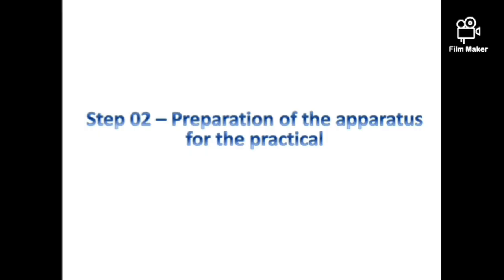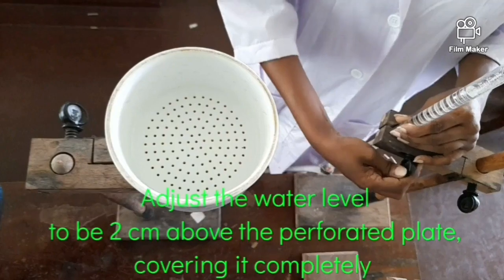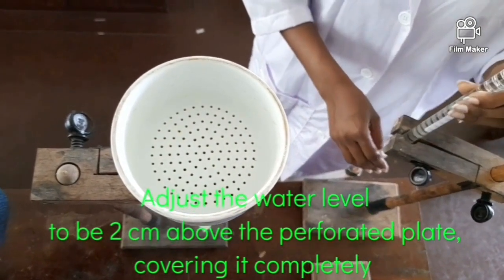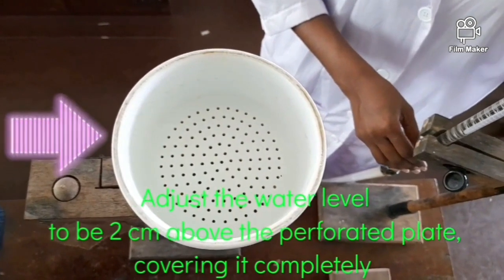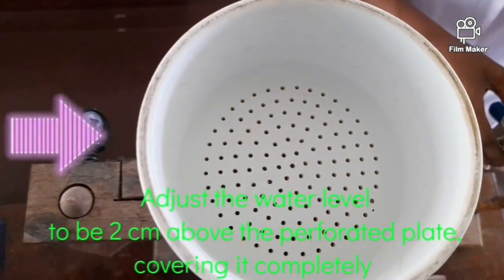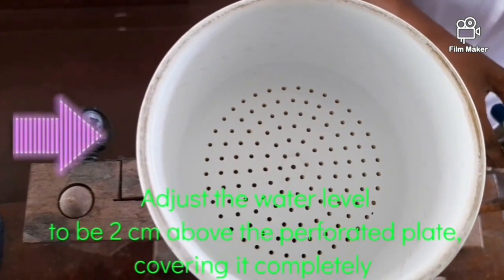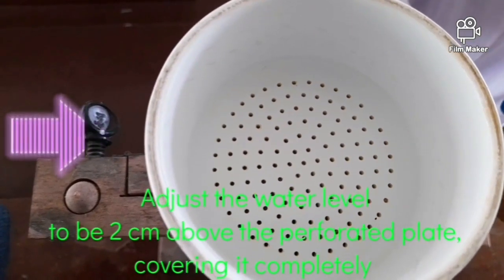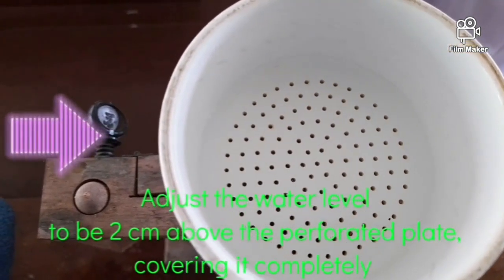Step 2. Prepare the apparatus for use. Here we raise the burette. At this time, the water level at the side of the funnel is increasing. You have to maintain the situation until you obtain a 2 cm raised water level above the perforated plate.